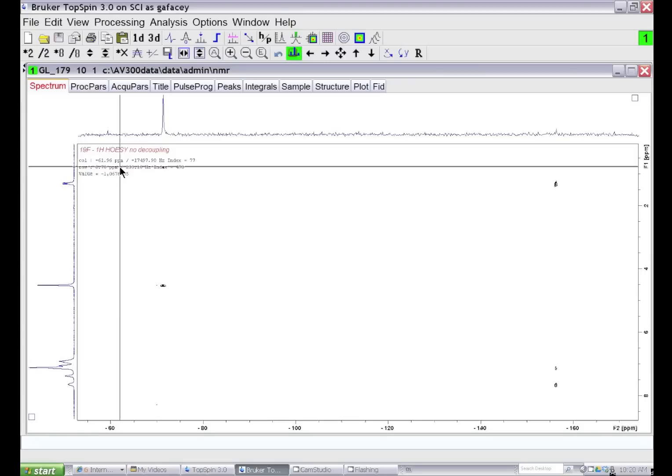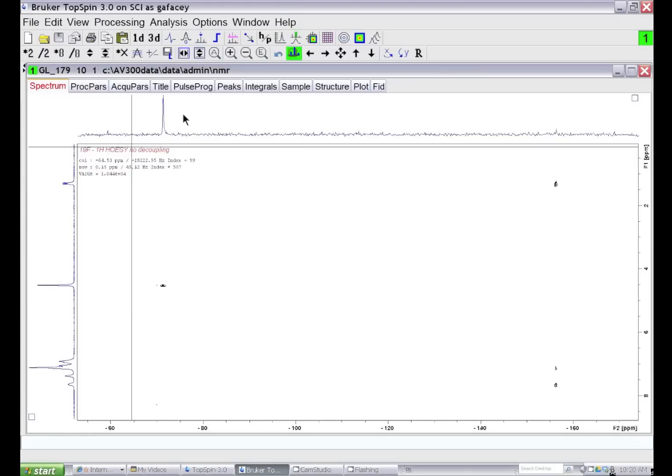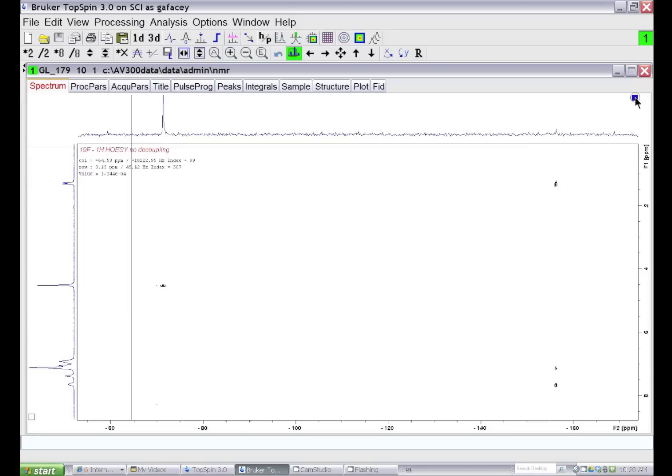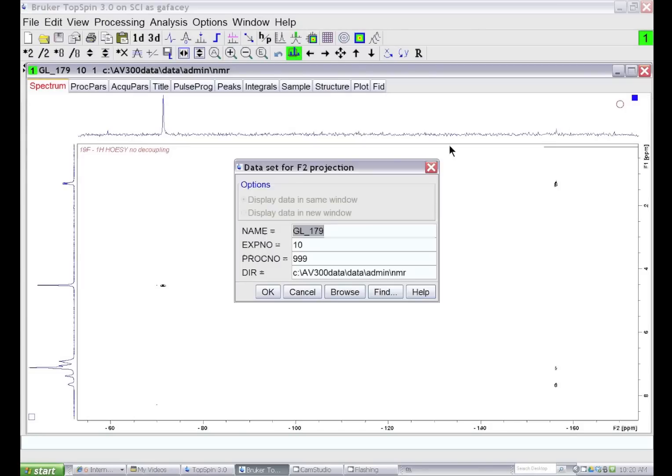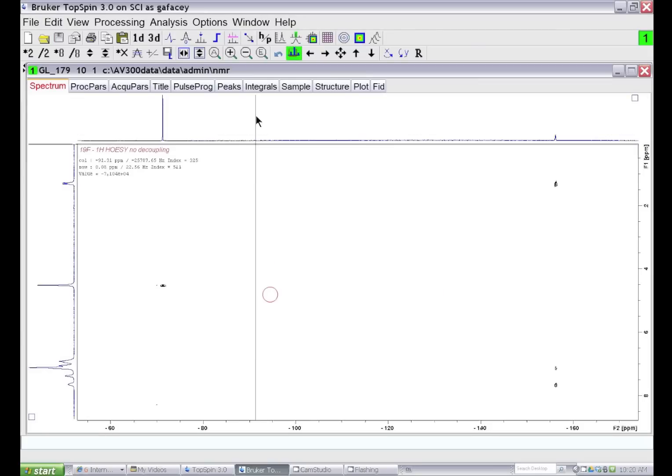One caveat is that if you had a real NMR spectrum stored as a projection to be displayed on top, this will now be the projection you saved with just the T1 noise. I'm going to recall the fluorine-19 NMR spectrum from experiment number 1. I'll select experiment 1 of this dataset, process 1, and put the fluorine spectrum back on top. You can see we have a very clean, presentable dataset.